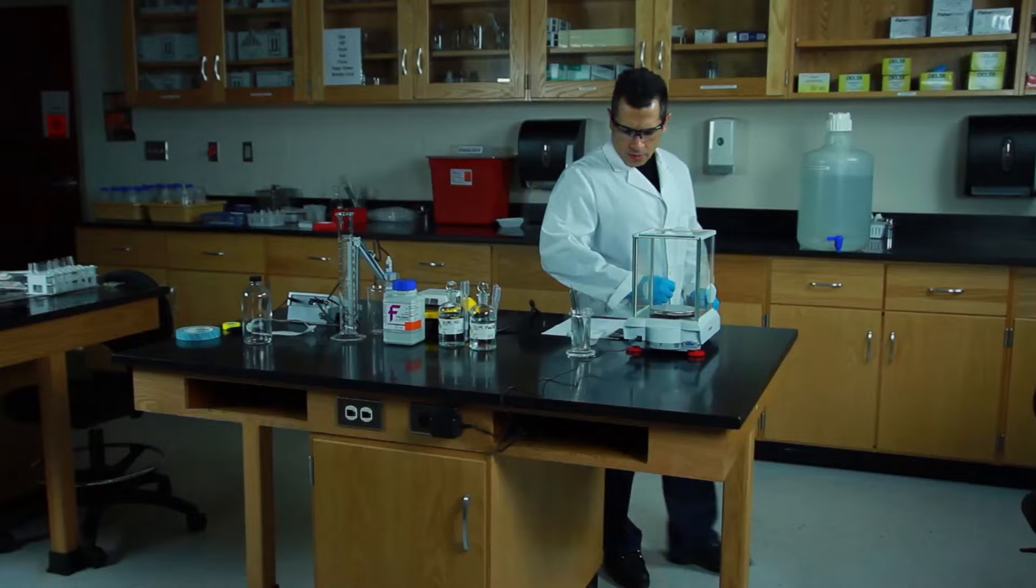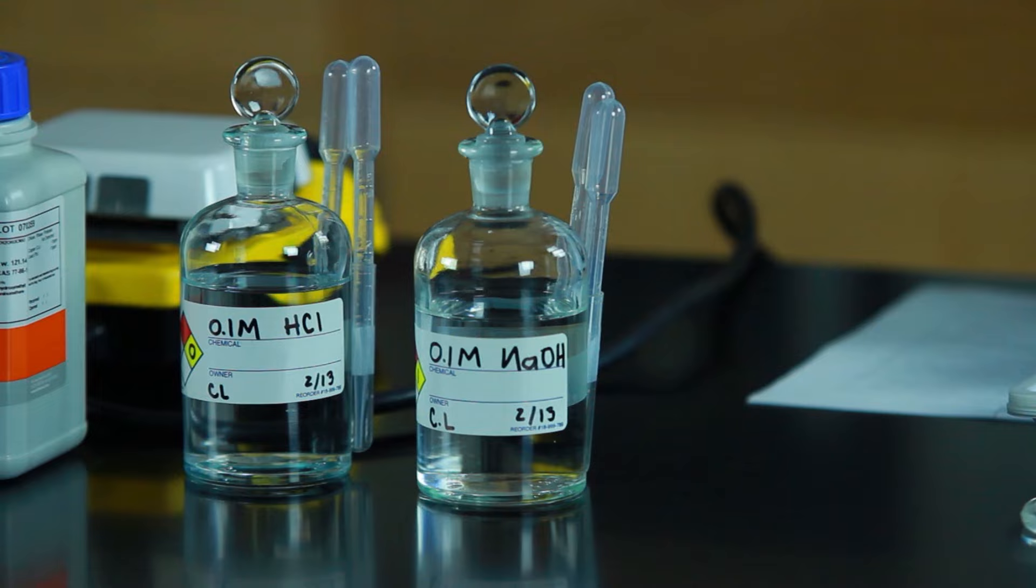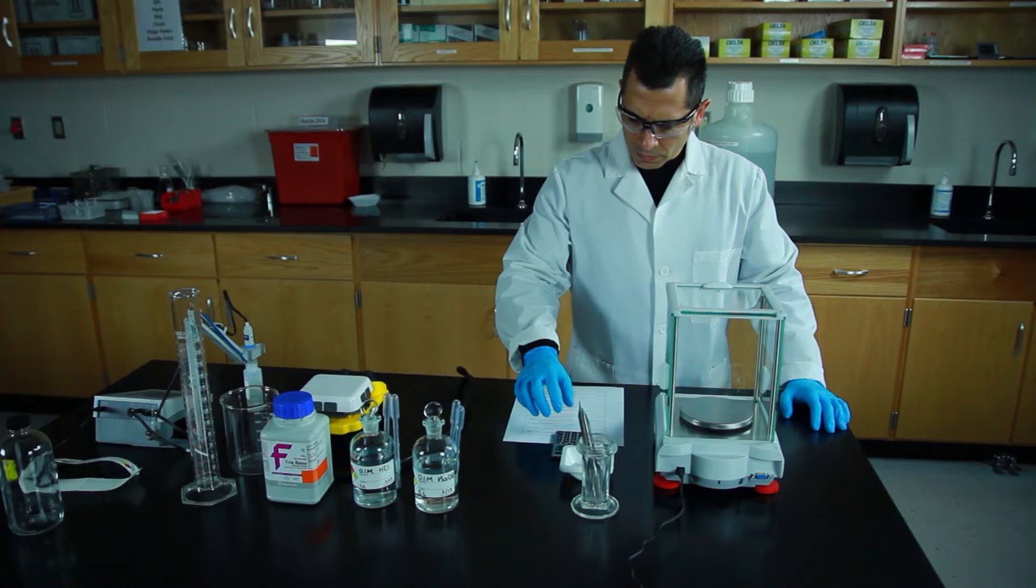Tris is a buffer that's used to maintain a stable pH when working with solutions in the lab. In this exercise we'll demonstrate the steps for preparing 250 milliliters of a 0.5 molar Tris buffer.